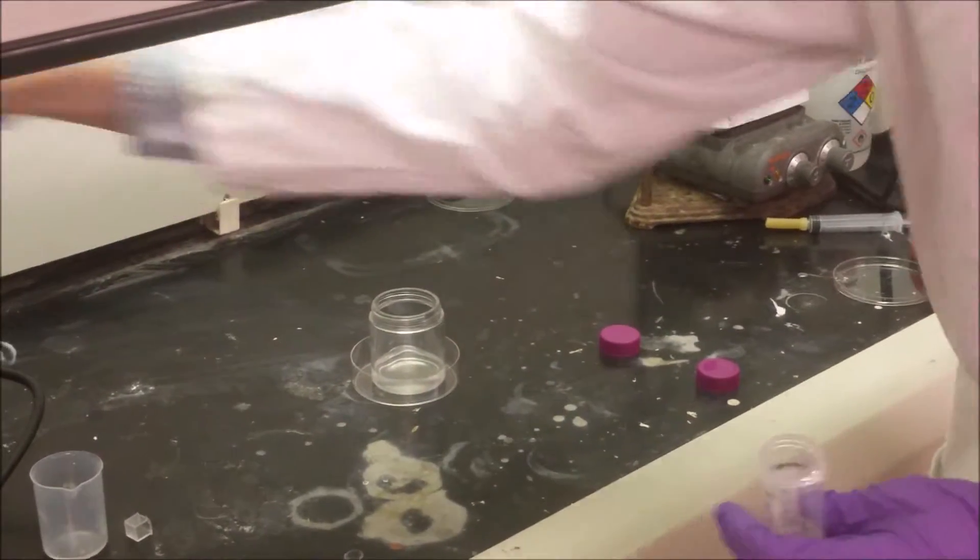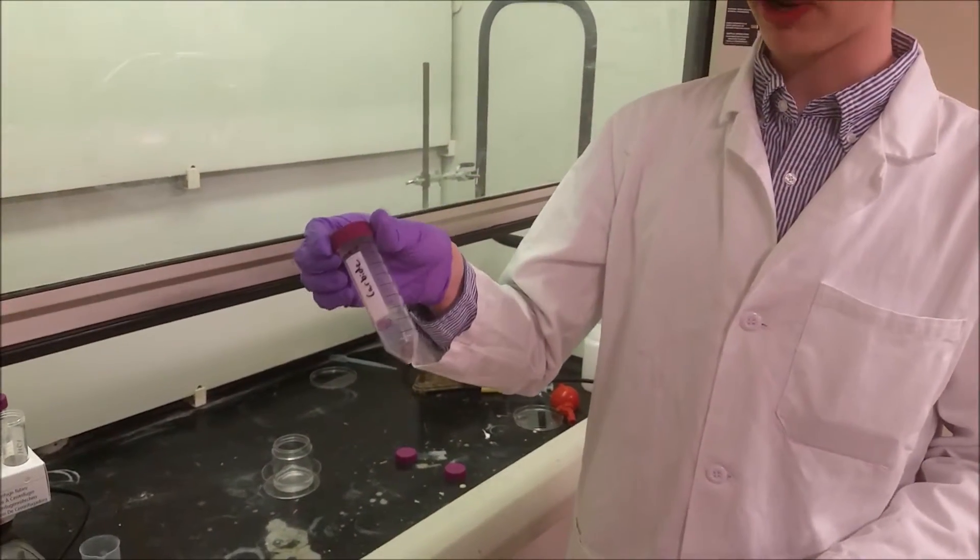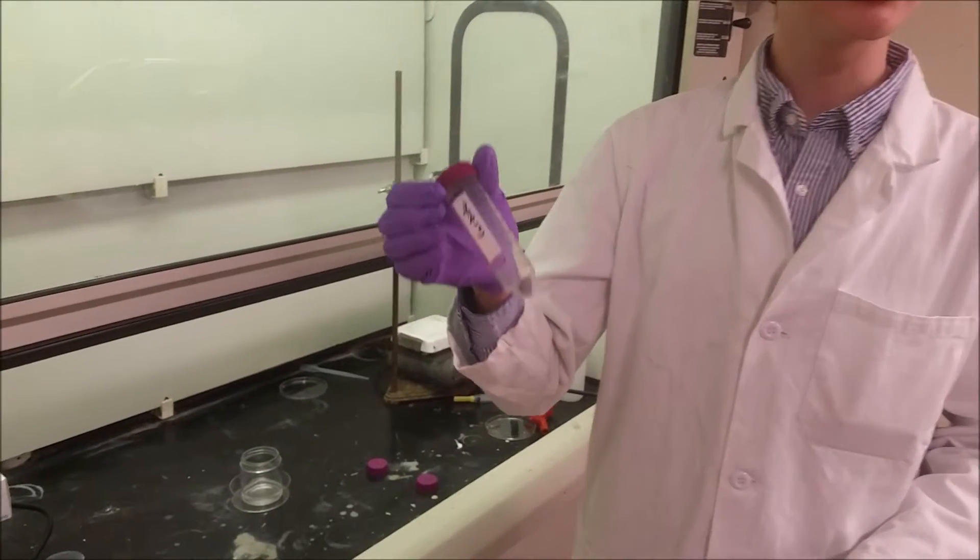And then we're going to prep our matrix rock. This is a material called calcium carbide, and when it interacts with water, it produces acetylene.